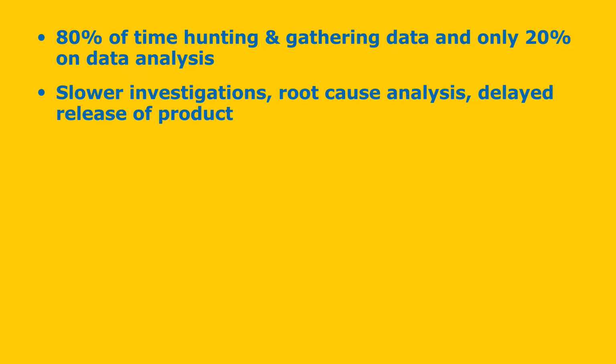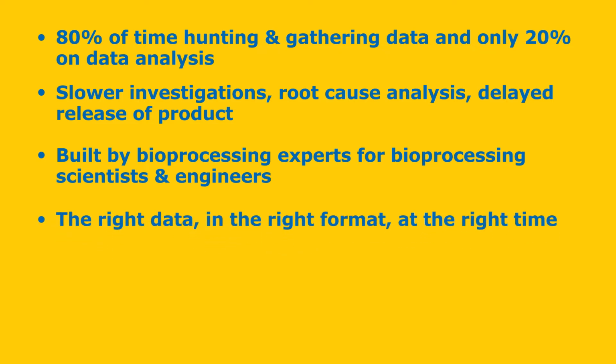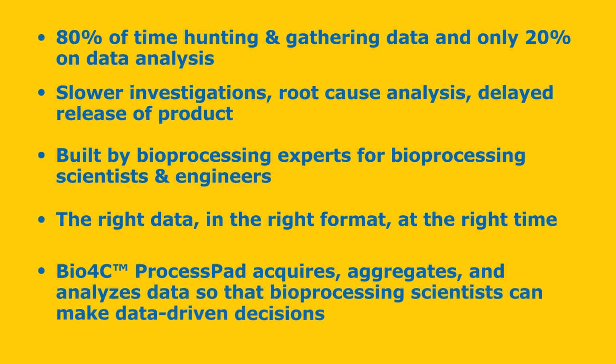Bio4C ProcessPad was built by bioprocessing experts for bioprocessing scientists, so they would have the right data in the right format at the right time. Bio4C ProcessPad acquires, aggregates, and analyzes data throughout the process lifecycle so that bioprocessing scientists can make data-driven decisions.